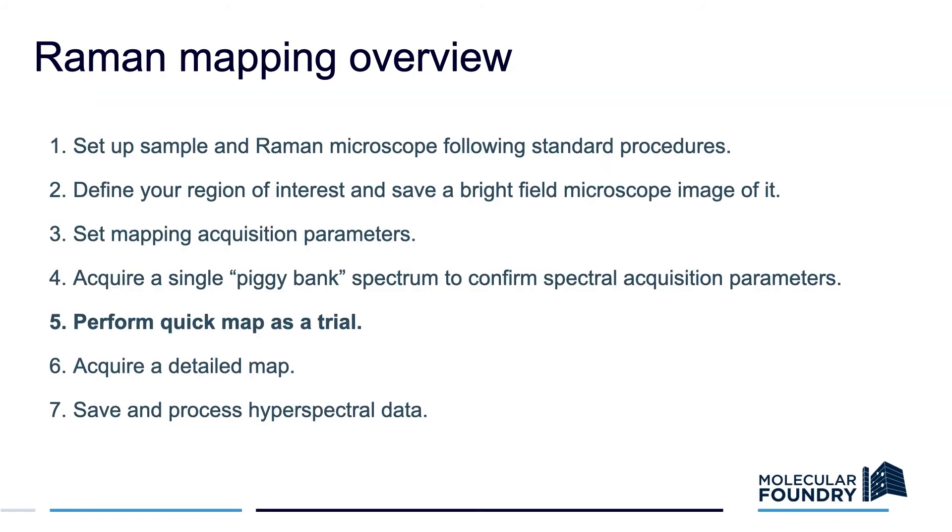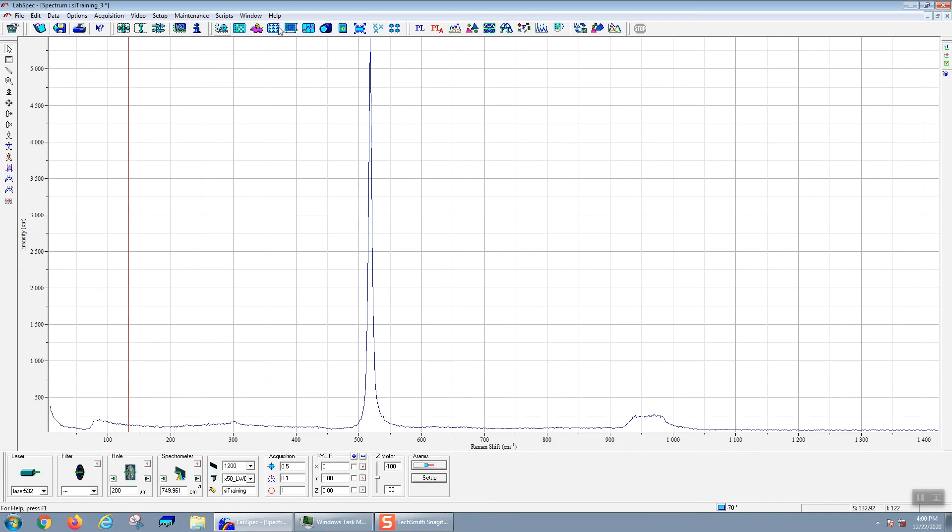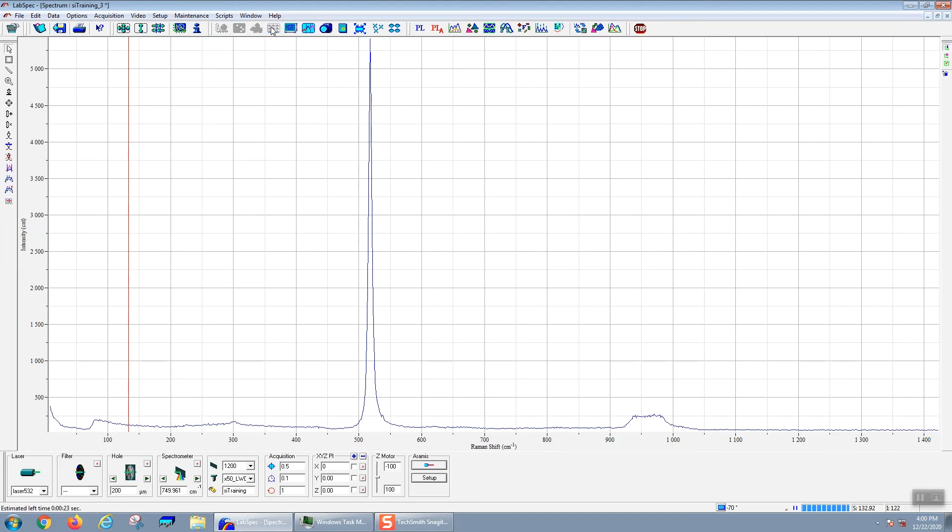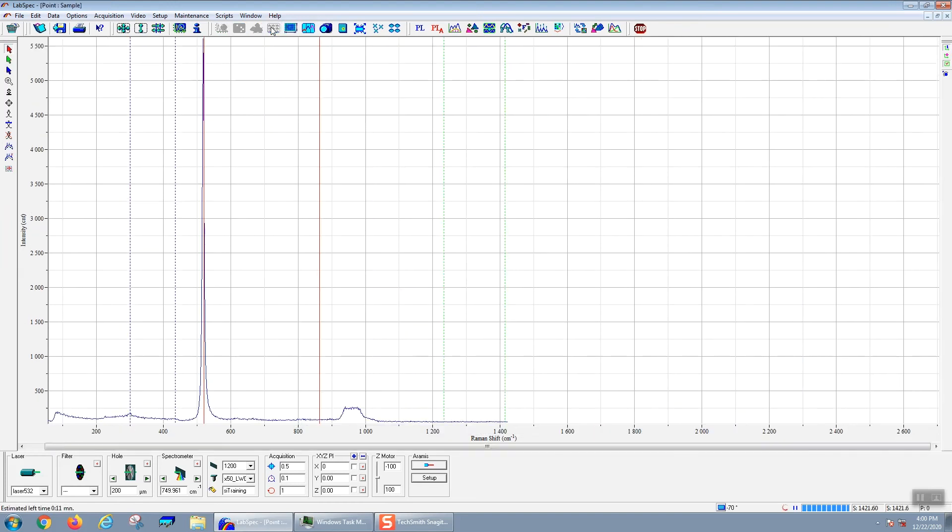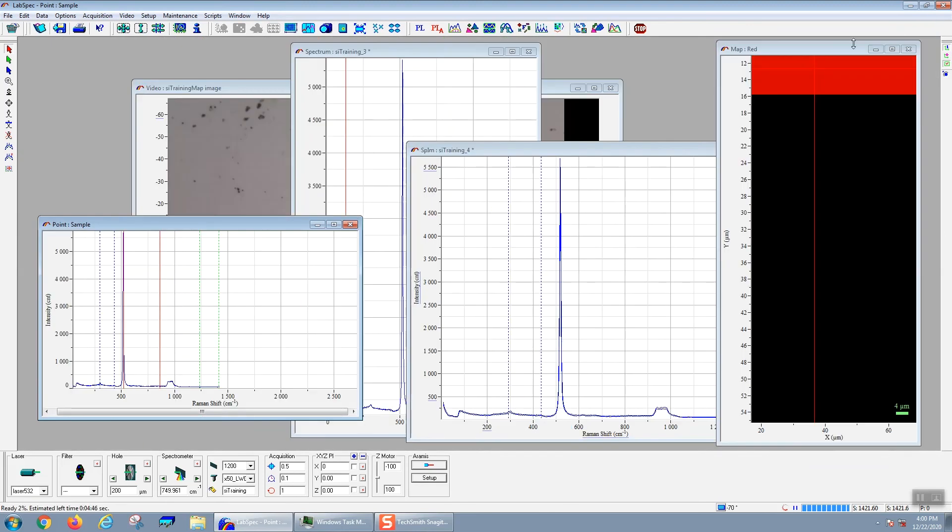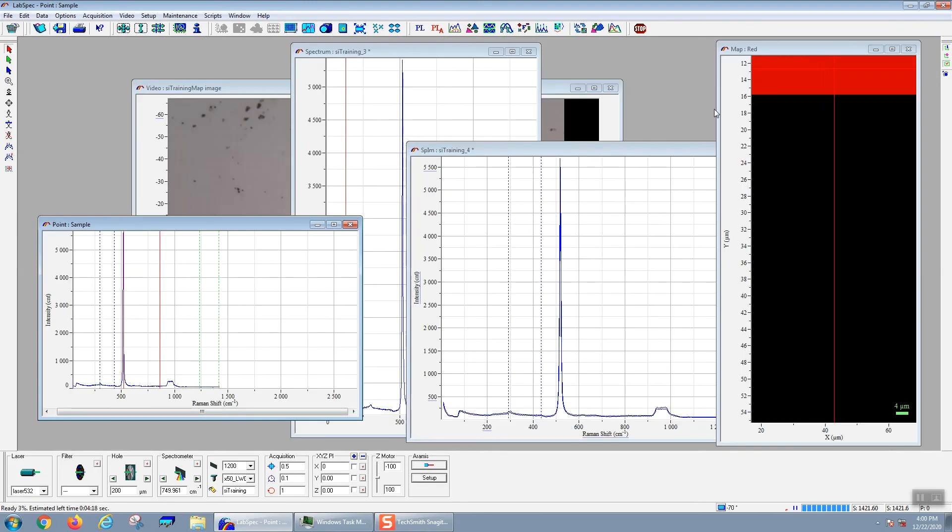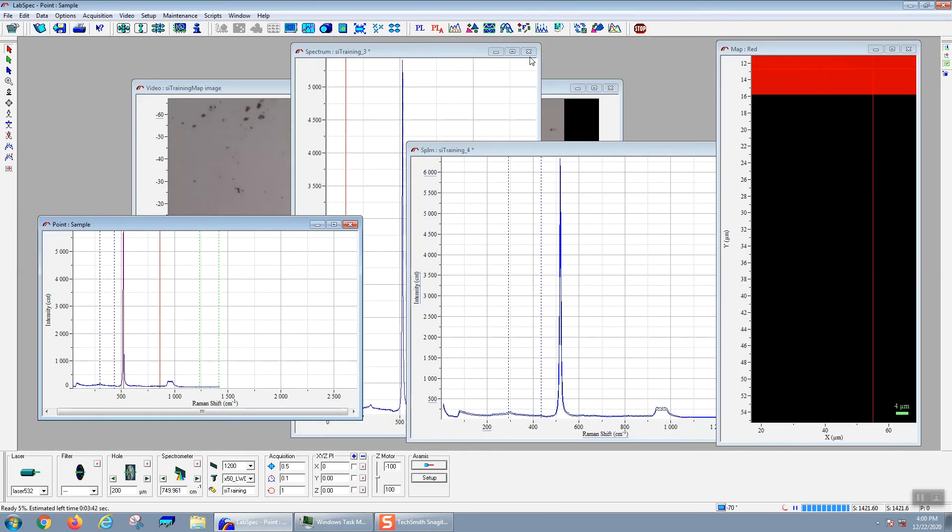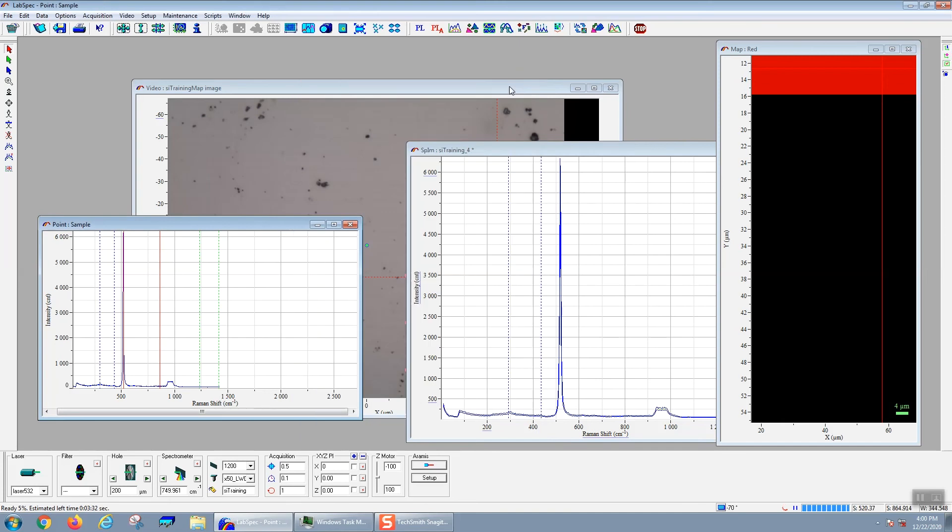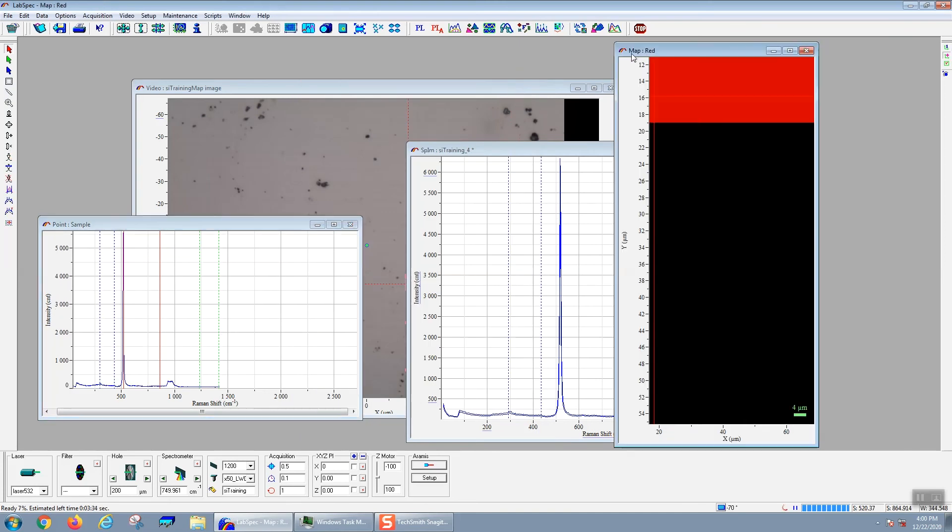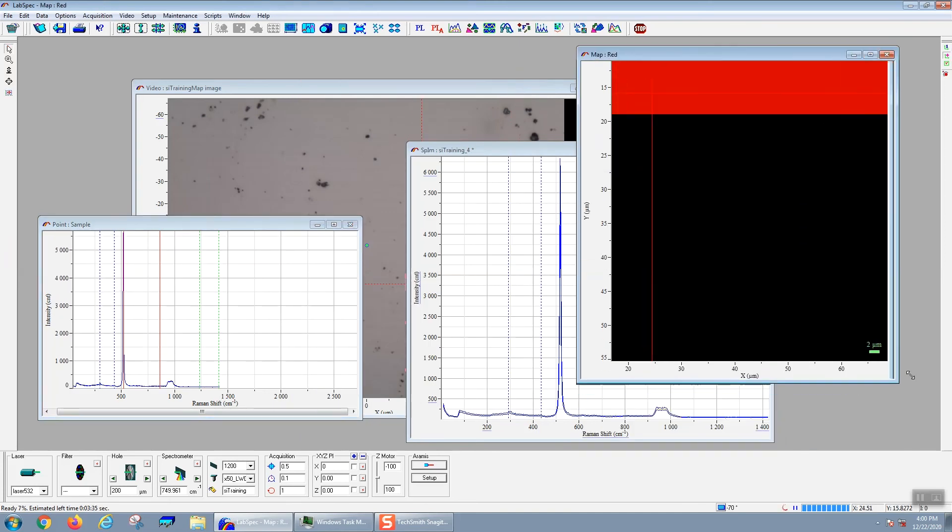Now that we've set up the parameters for both the mapping and the spectral acquisition, we're ready to perform a quick map. We'll acquire a quick map by clicking on this icon that looks like a grid of spectra. This is the mapping acquisition button. It can take a little while for the mapping to start. It's pretty processor intensive. I always recommend that you don't have other maps open. You would want to close all the other maps before you start a mapping acquisition.